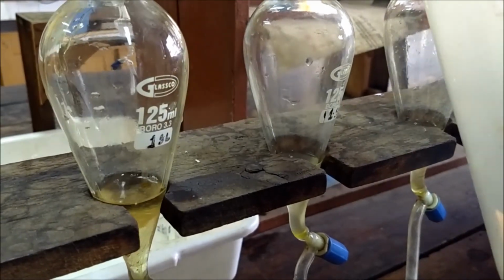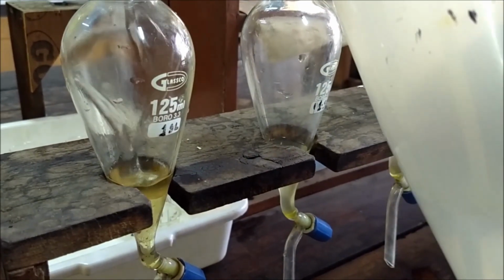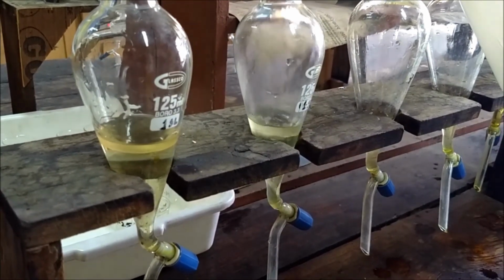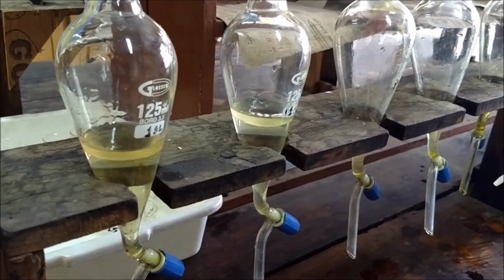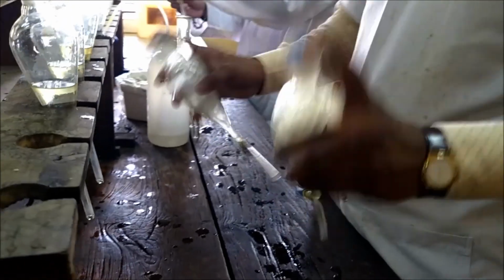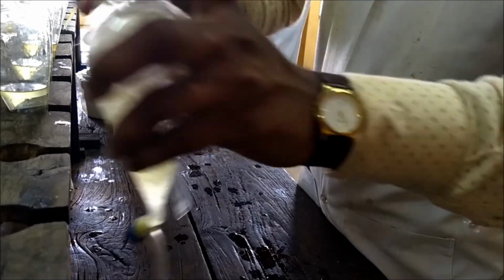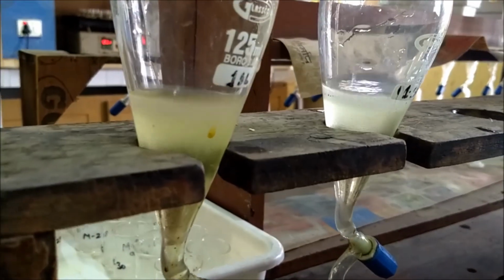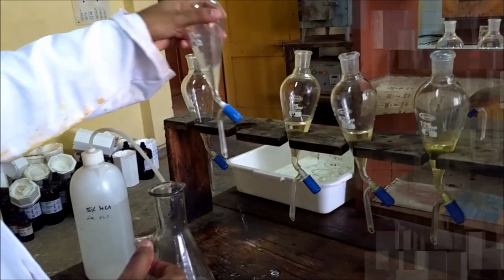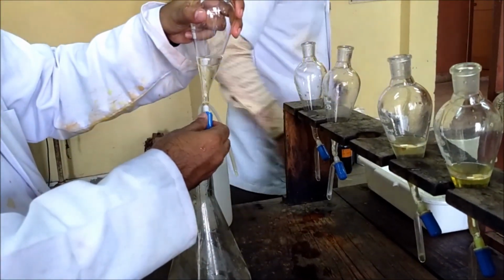We are going to repeat the washing process with 5% HCl till a transparent organic layer is observed. This will ensure that only the gold MIBK complex exists and iron has been totally removed from the organic phase. Generally, a transparent organic phase is obtained after 2 washings with 5% HCl solution. But sometimes it may take more washings.